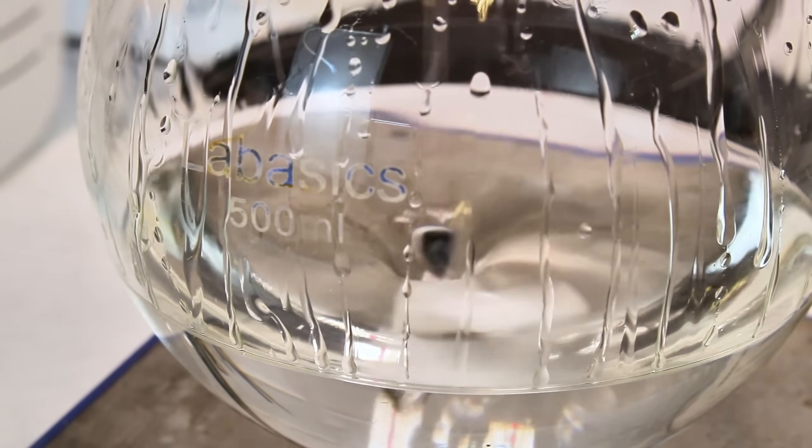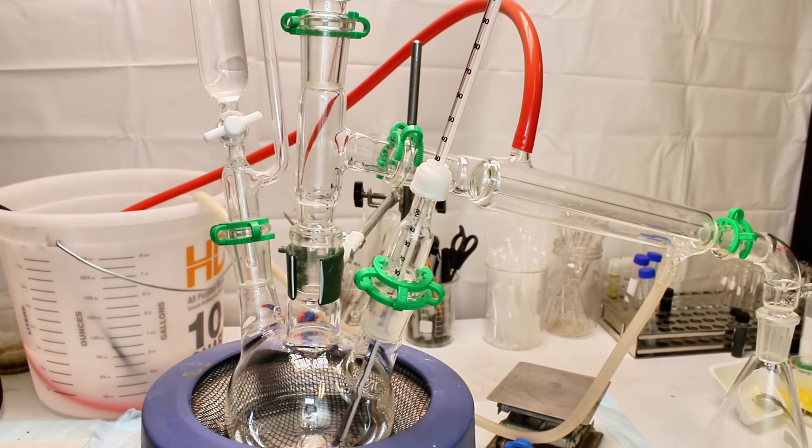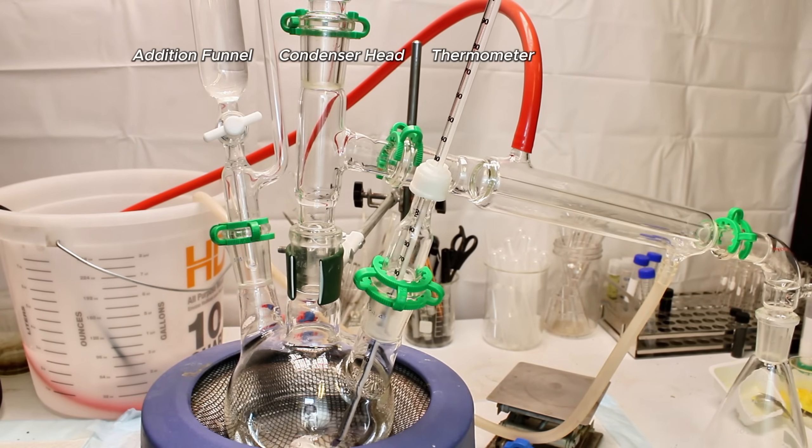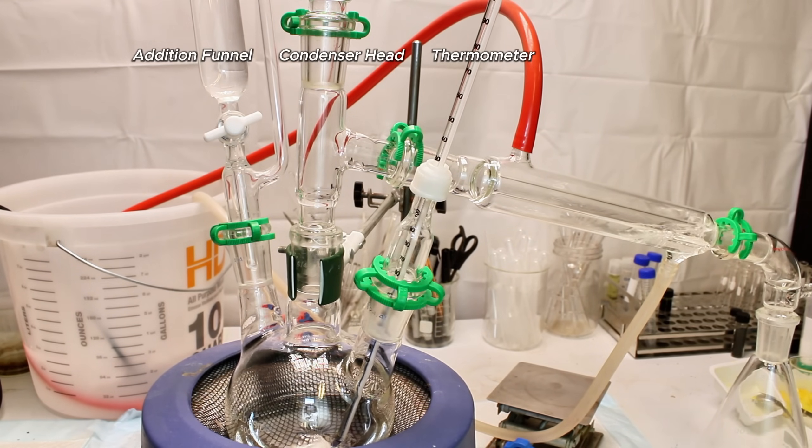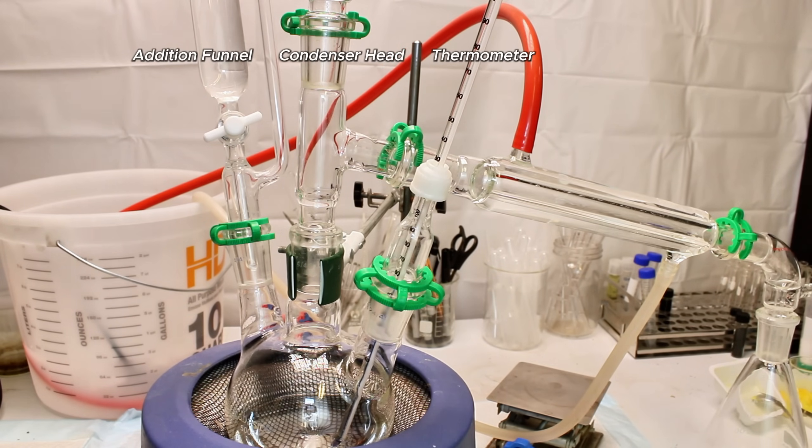Once all the sulfuric acid has been added, I construct a distillation apparatus as shown here. On the center neck, I've connected a simple adapter linked to a Liebig condenser leading into a collection flask, while on the left neck, I've connected an addition funnel, and on the right neck, I've connected a thermometer.